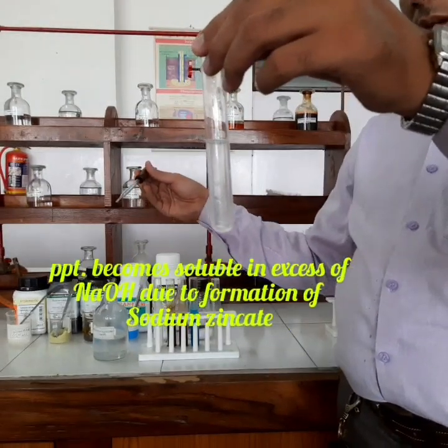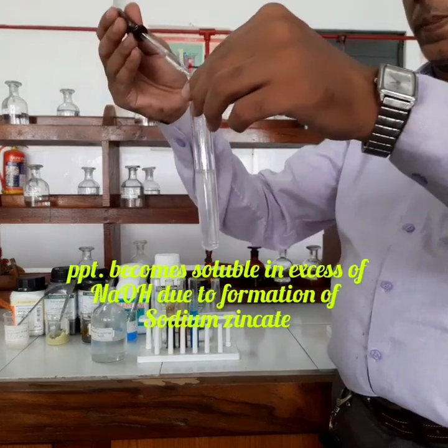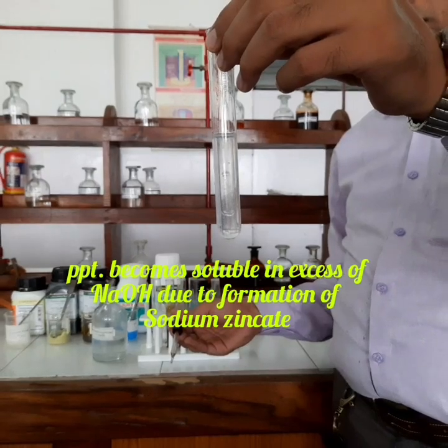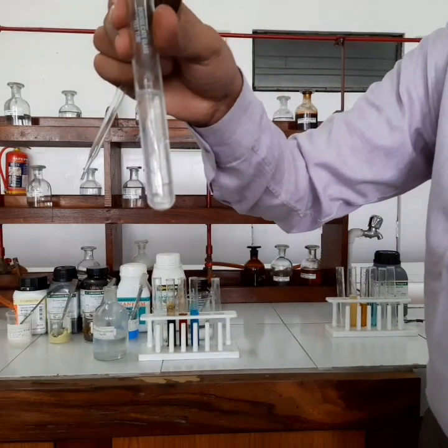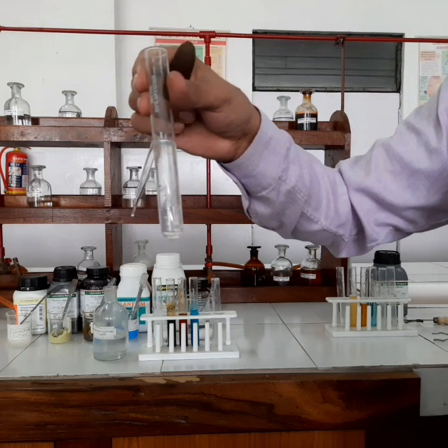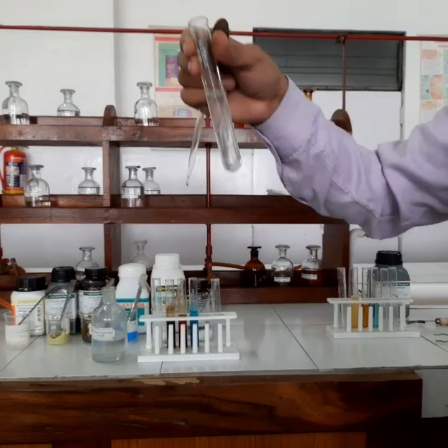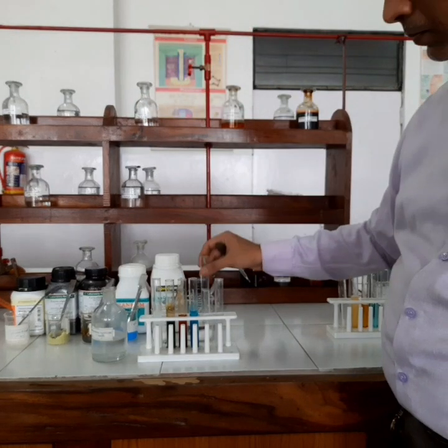As you can see, when I am adding excess of NaOH, the solution is becoming colorless. Why is it becoming colorless? Because of the formation of sodium zincate. Sodium zincate is a soluble salt. So you can see that the white precipitate that had been formed has disappeared because of the formation of soluble sodium zincate. Zinc hydroxide that had formed earlier as a gelatinous precipitate has changed into sodium zincate, and now it has become soluble.